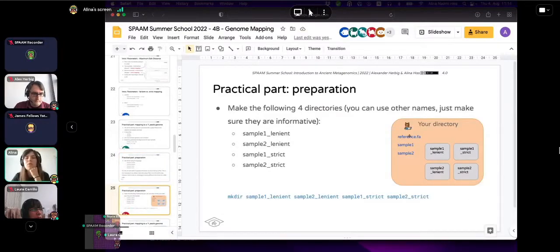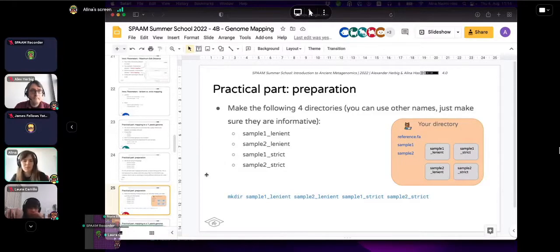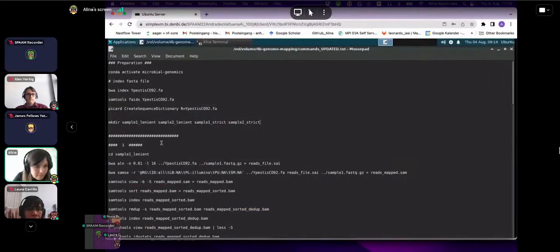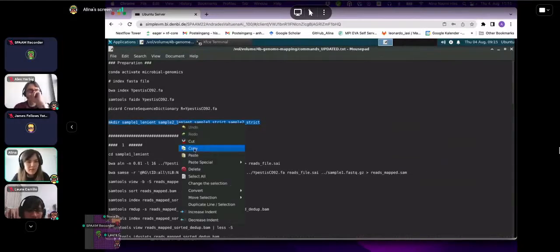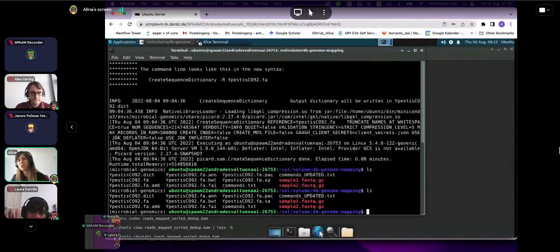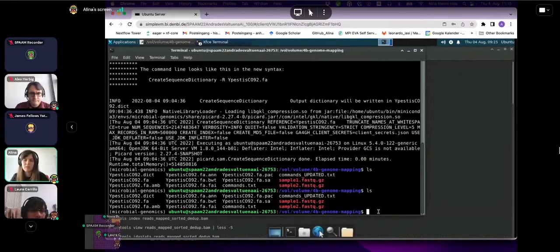Run the mkdir command with all four directory names. Once done, you should see four directories. You'll also notice new indexed files for the reference genome created by the earlier indexing commands. Now, change directory into sample1_lenient (cd sample1_lenient). It's currently empty — that's expected.